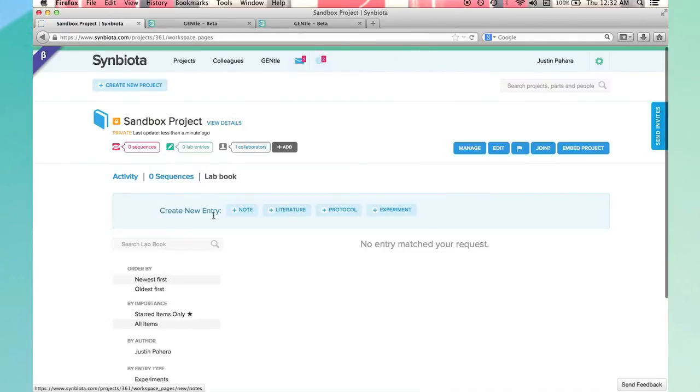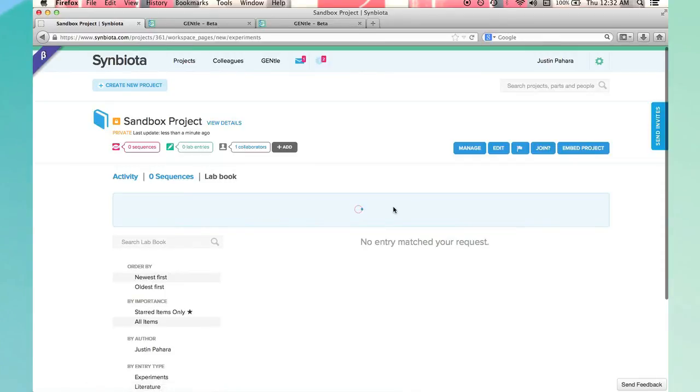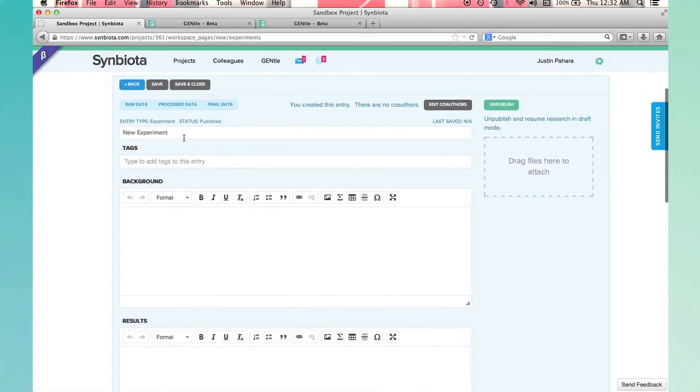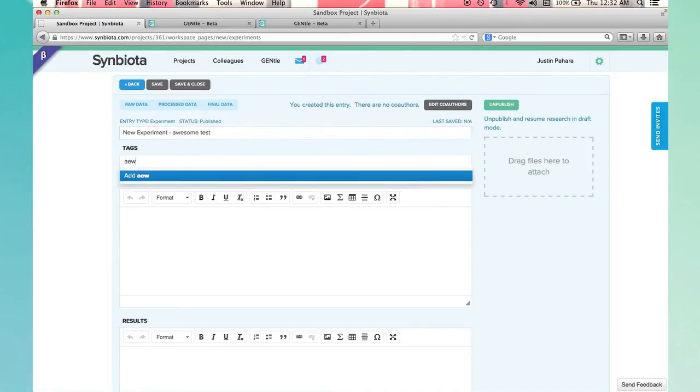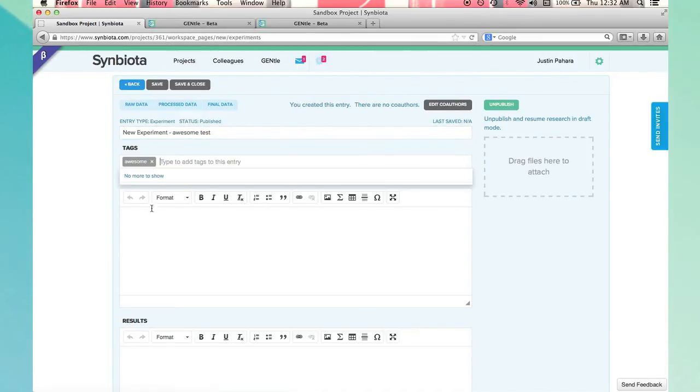If I want to create a new entry, I do this by clicking the new entry type. For an experiment, I would add a title and tags and enter in text.